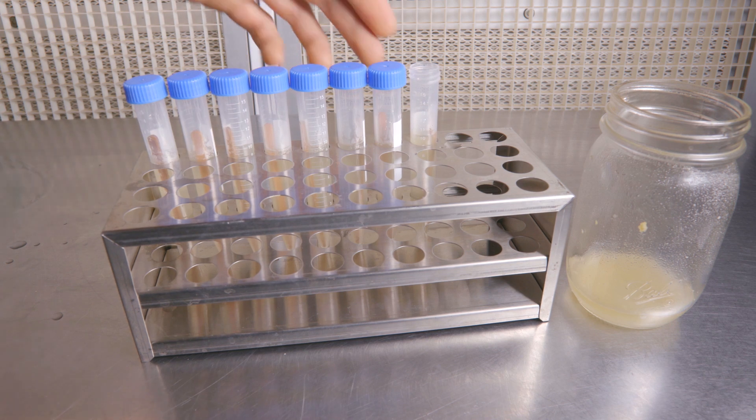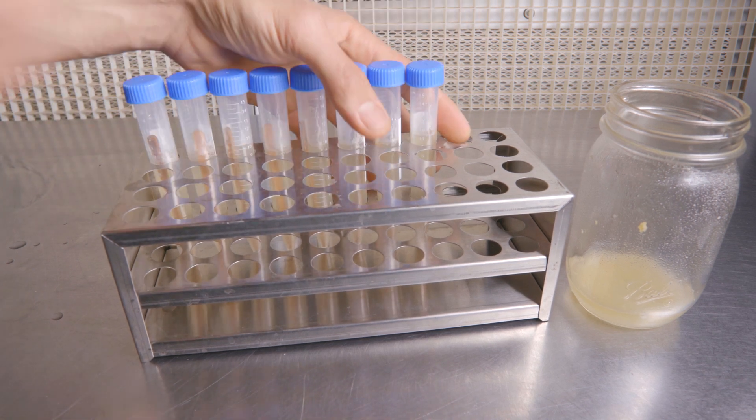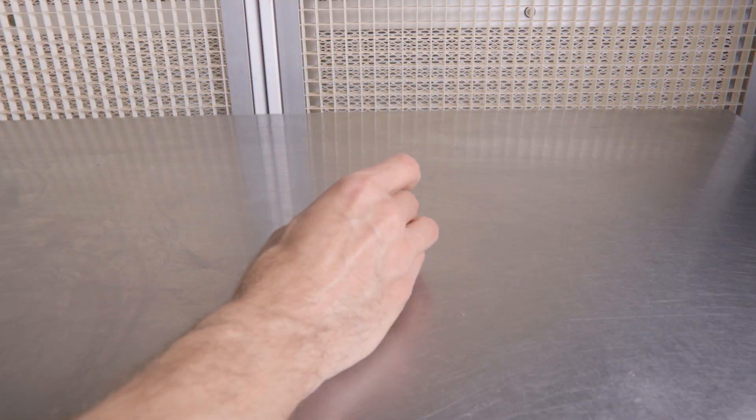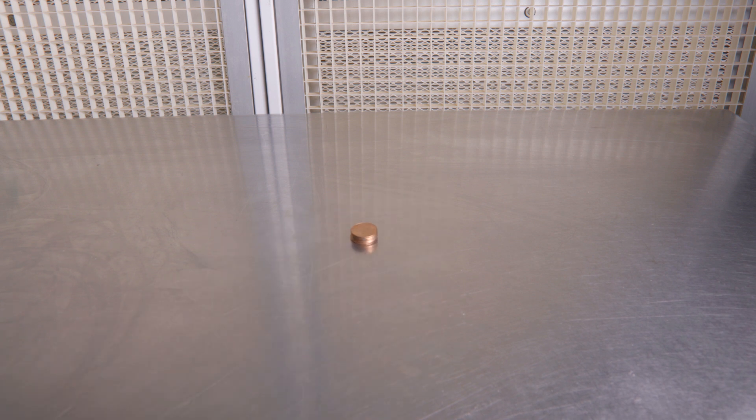Now it's time to cap off our slants and place them at a slope for cooling. Here I'm using a stack of pennies. Add or subtract pennies to get the slope of your preference.